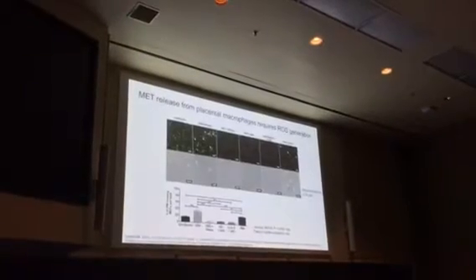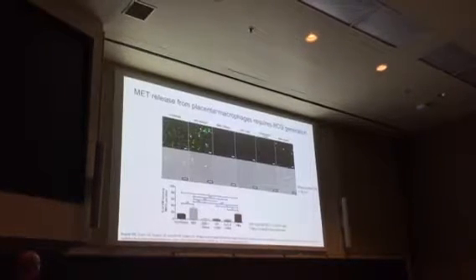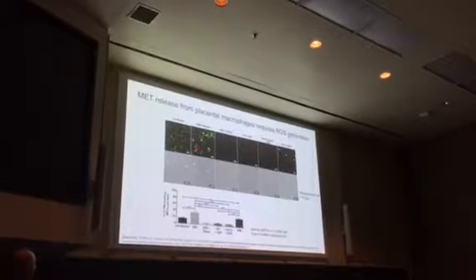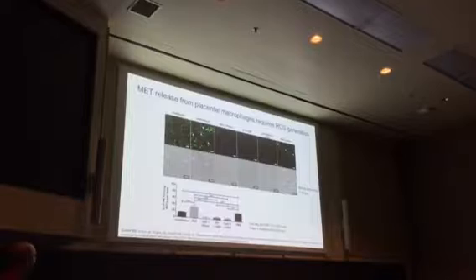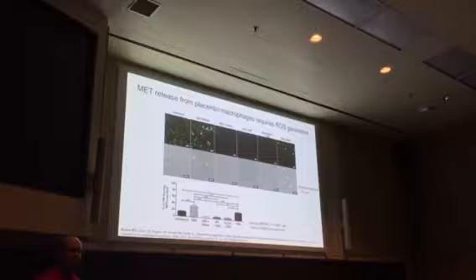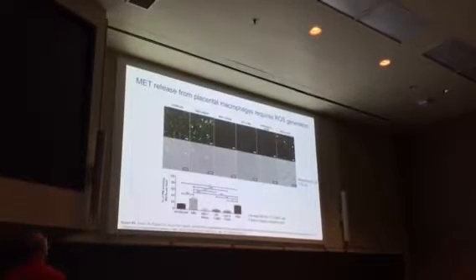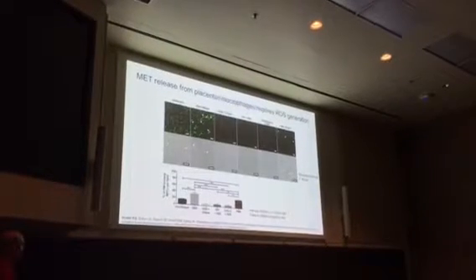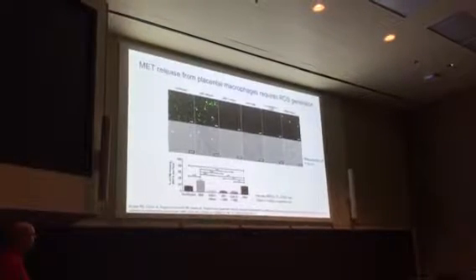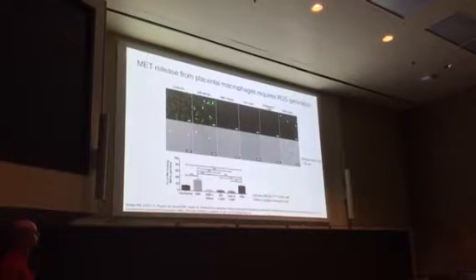So I wanted to look to see, is reactive oxygen species, or ROS, important in placental macrophages to release these traps? So again, using the same infection setup at MOI of 21 for 1 hour, but now we're going to pre-treat these cells with DPI, which is a non-specific inhibitor of NADPH oxidase, and then cytochalasin D again, that actin cytoskeleton inhibitor. And we can see, compared to those cells that we've infected with GBS, if we pre-treat with either DPI or cytochalasin D, we lose this extracellular trap response. We don't see as many of those structures coming off cells.